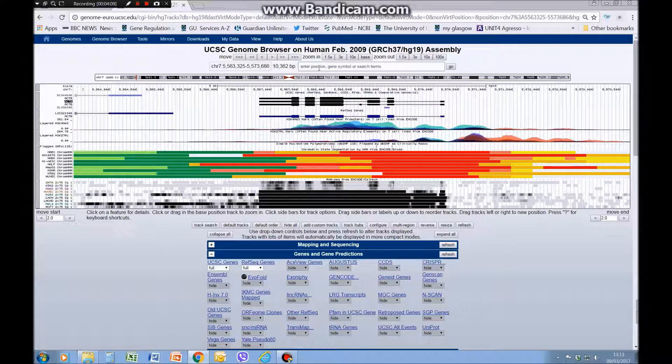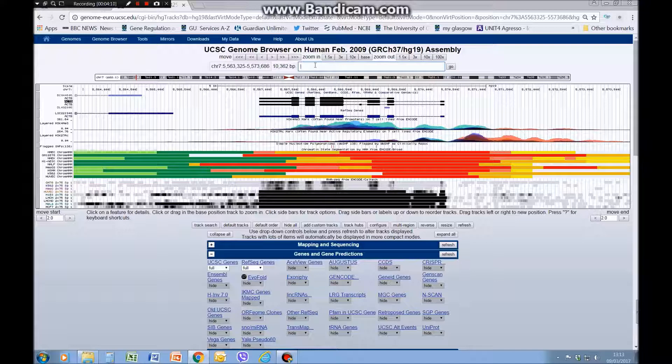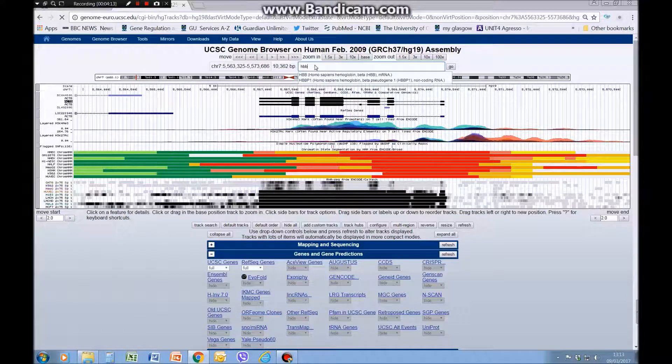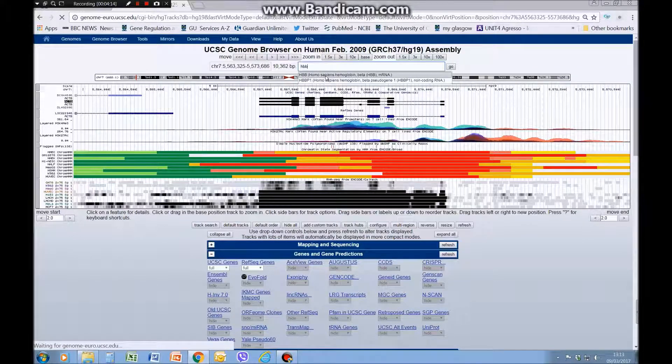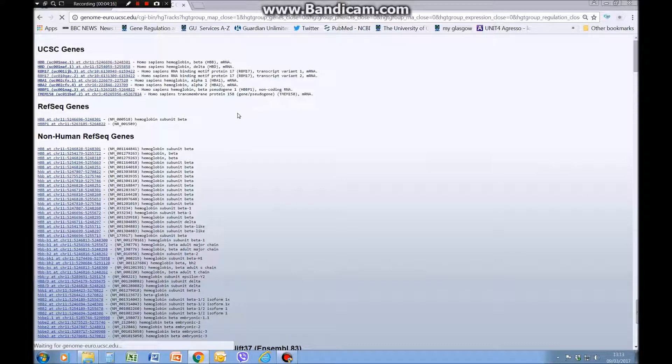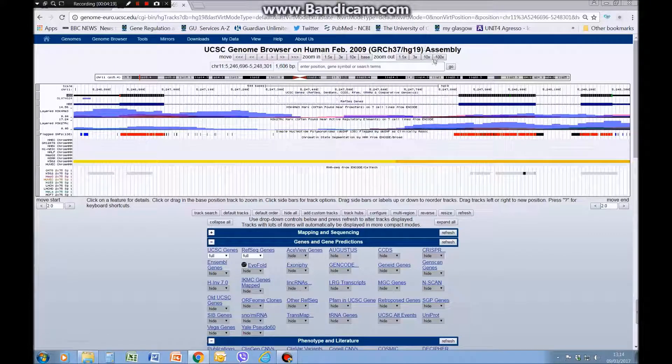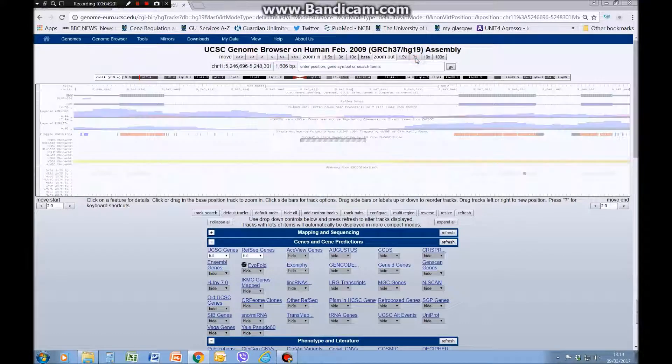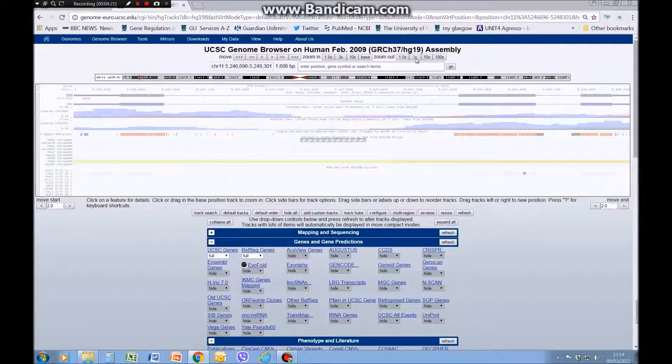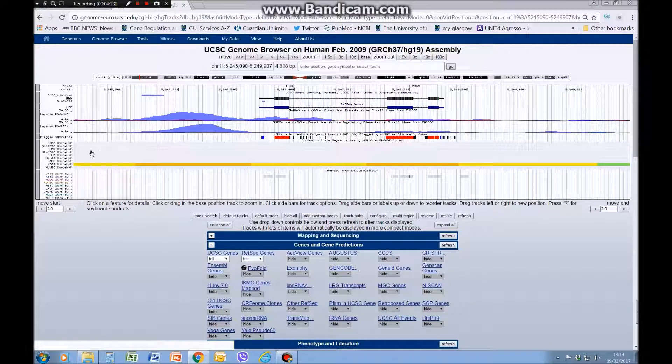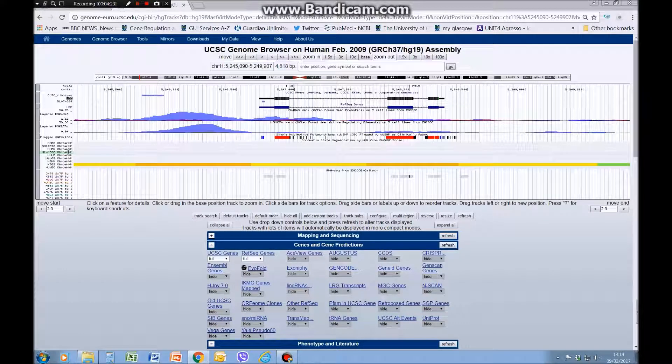We can take this back and look at the H beta globin gene that we were looking at before. So we get a very different pattern for that, I'll just zoom out a bit.